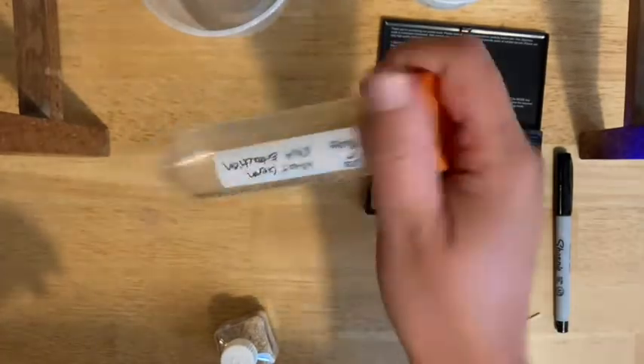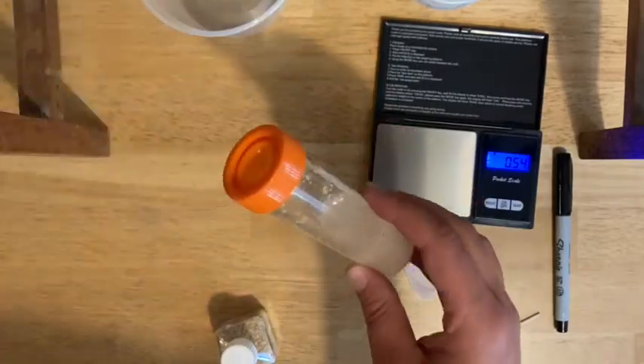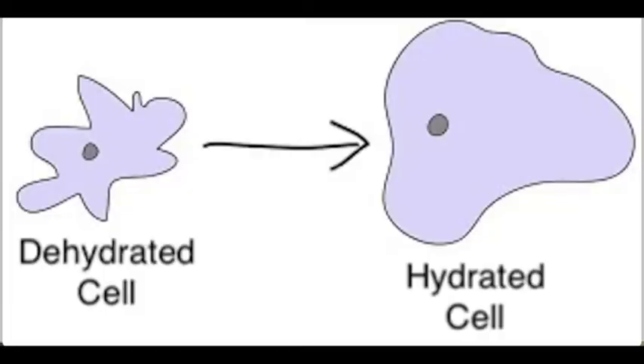Cap it up and mix — you want to do 40 inversions. Count all the way up to 40 before you move on to the next step. When you're adding the warm water to the wheat germ, you're basically rehydrating it — filling the cells full of water and preparing them to be burst open.